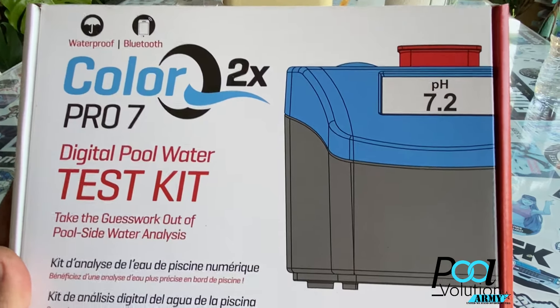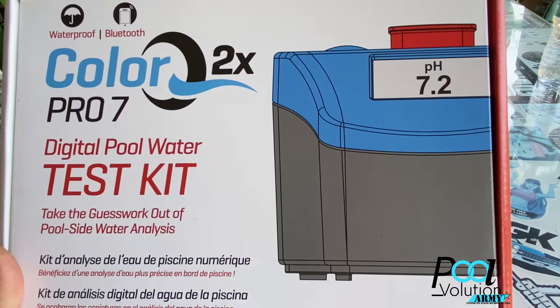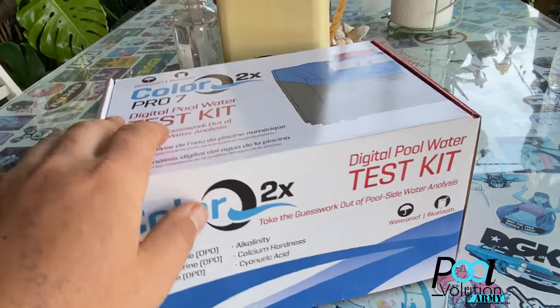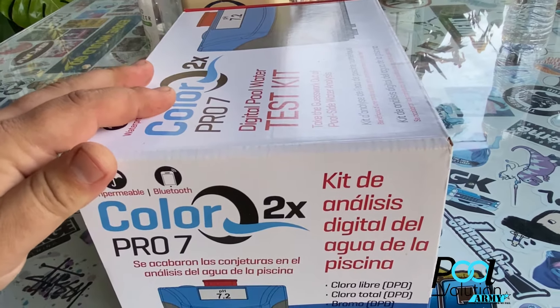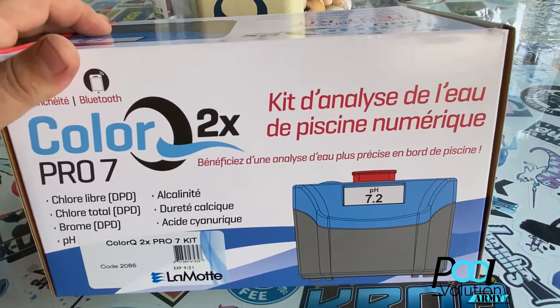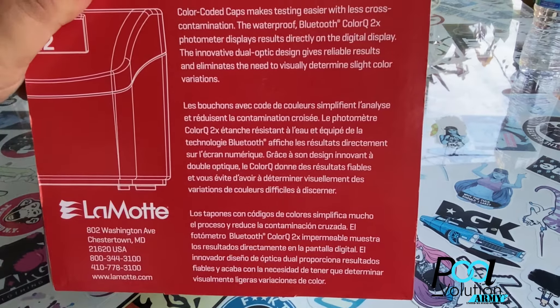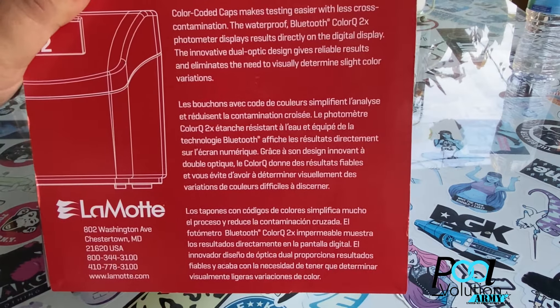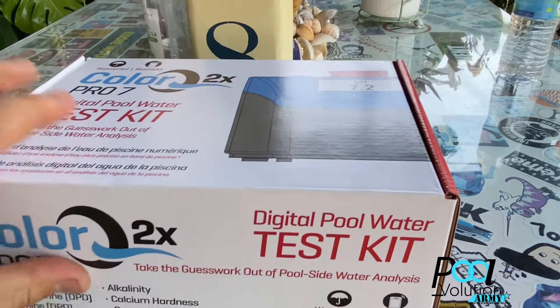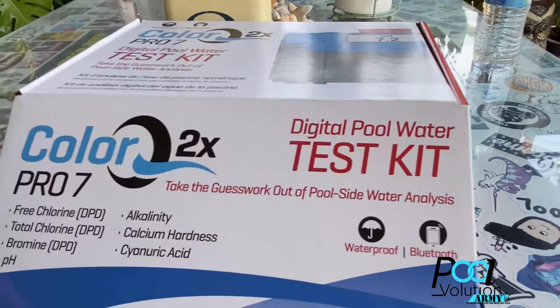I recently purchased this about a month or two ago — this is the ColorQ 2X Pro, code 2086, from Lamont Digital water test kit photometer. It's Bluetooth and waterproof, and the Bluetooth means it hooks up to the Water Link Solutions app, which is the same app as the Spin Touch. I bought this because not everybody wants to spend $700–$900 on a Spin Touch, so for $200 this is what you can get.